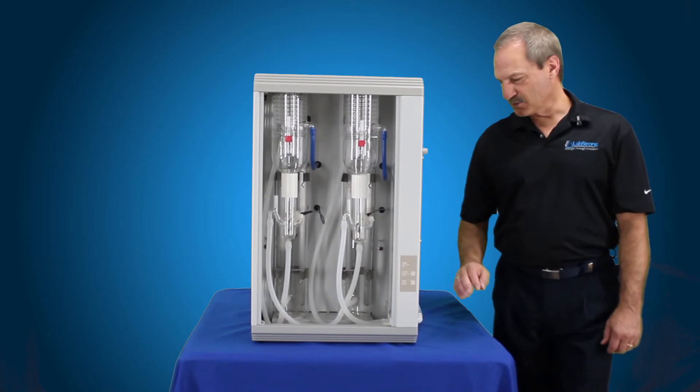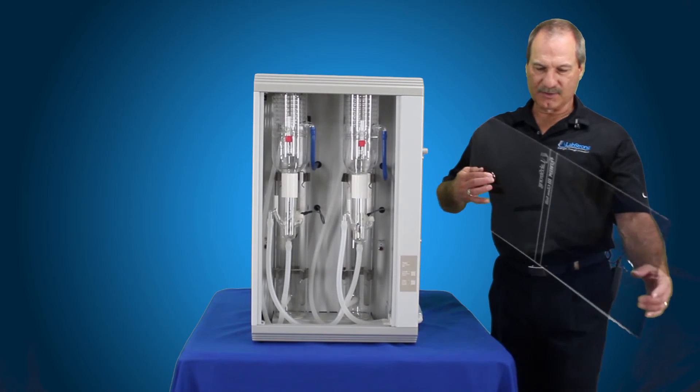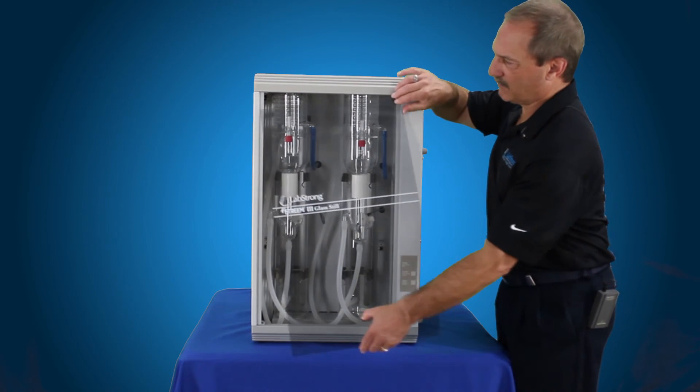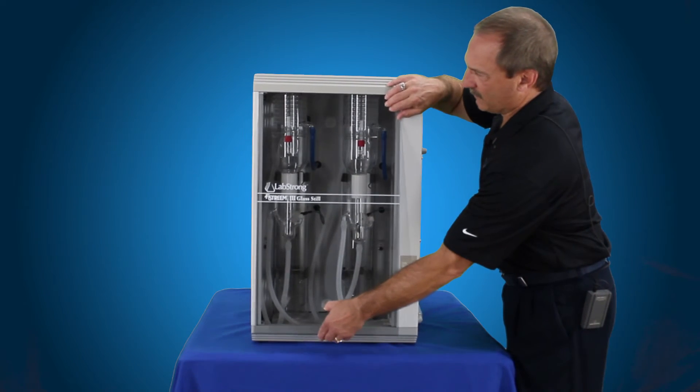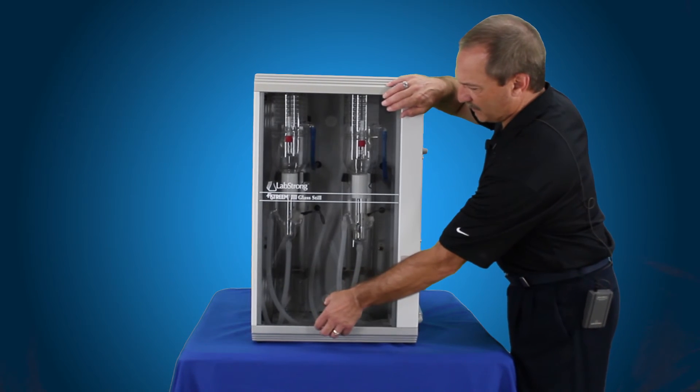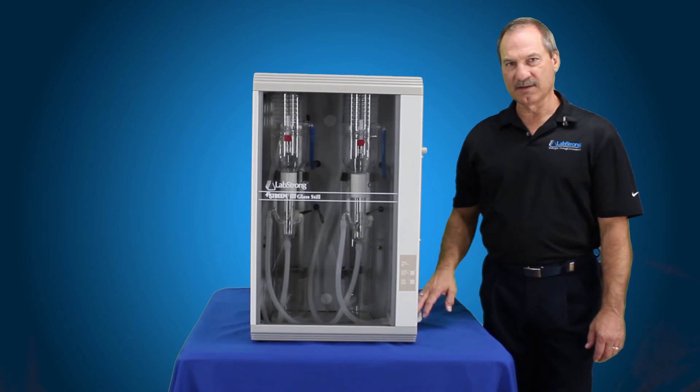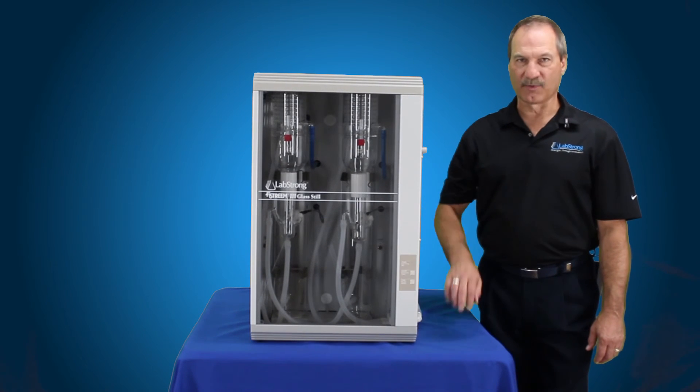Now that you've got those replaced and it's ready to start back up again, grab your door. Always operate your still with the door in place. Simply put that up inside of the slotted hole on top, slide the bottom into the slotted hole in the bottom, and then you can go ahead and turn your power back on, turn your water back on, and operate your still.